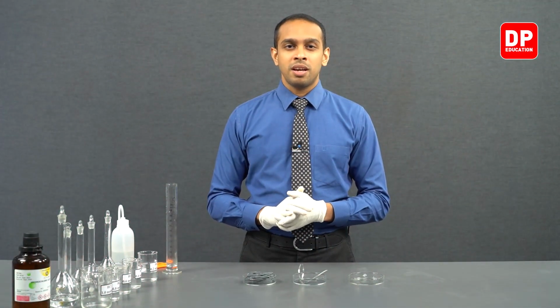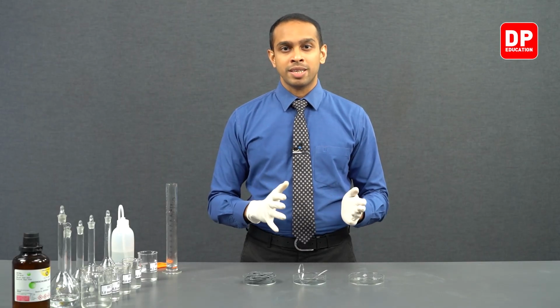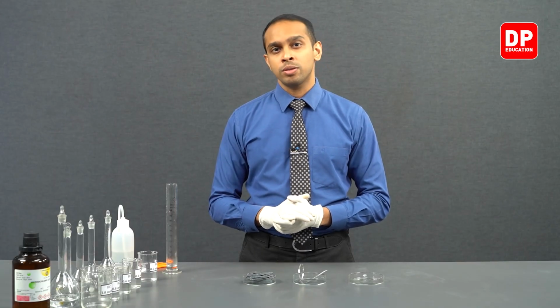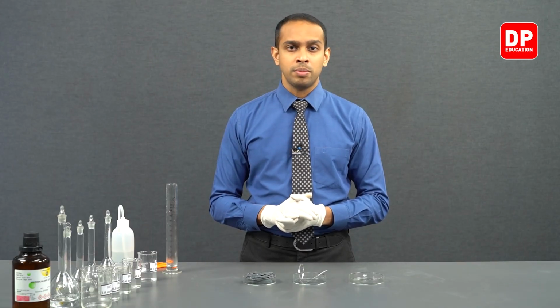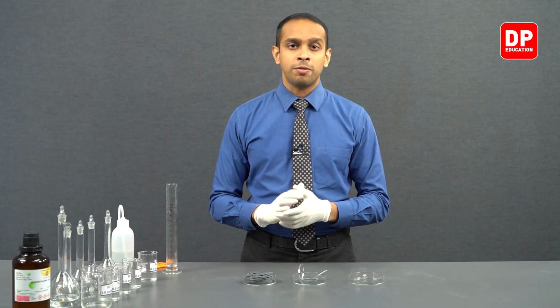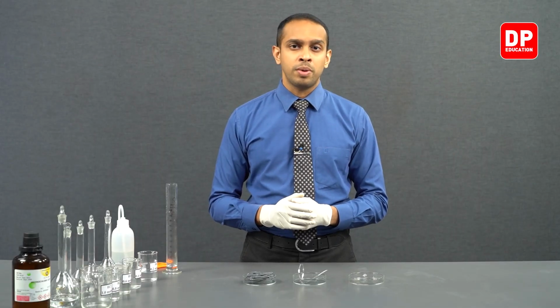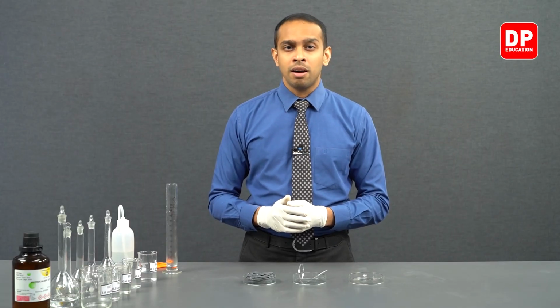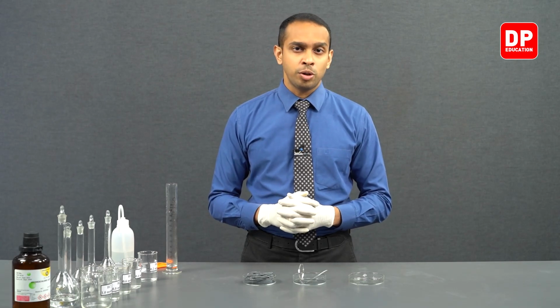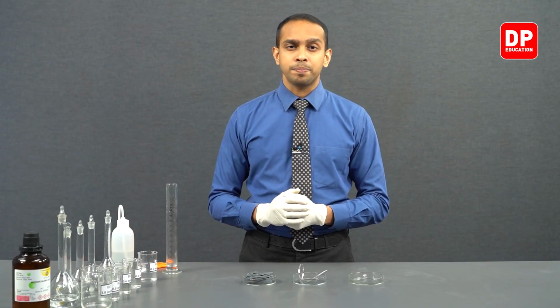Now students, in this part of our experiment, we are going to observe the reaction between magnesium and hydrochloric acid. Magnesium is a metal found on group 2 of our periodic table, and it is a reactive element. So therefore, when you react magnesium with HCl, you are going to observe the formation of magnesium chloride and hydrogen gas. So the only observation you are going to note is the evolution of a colorless gas.